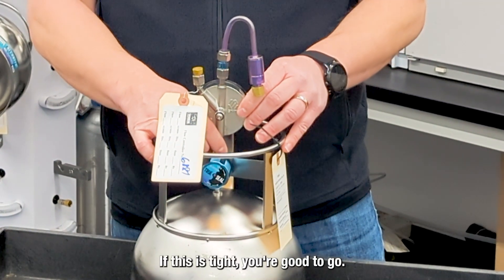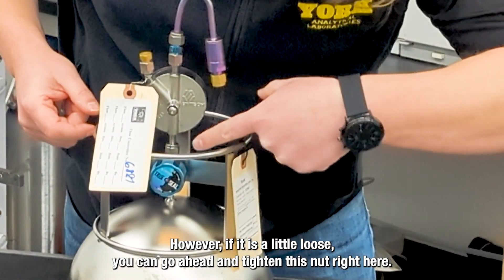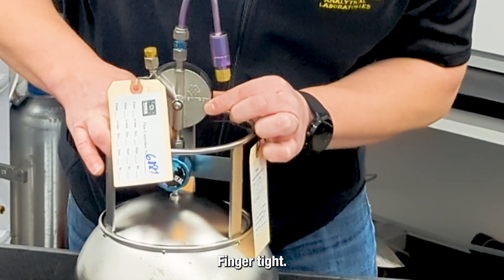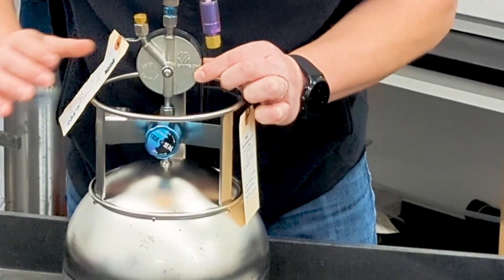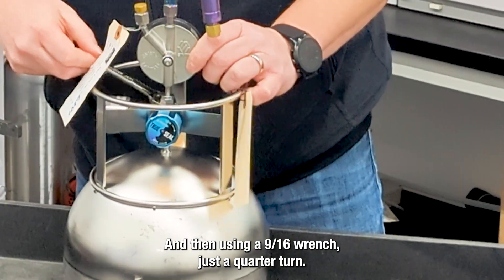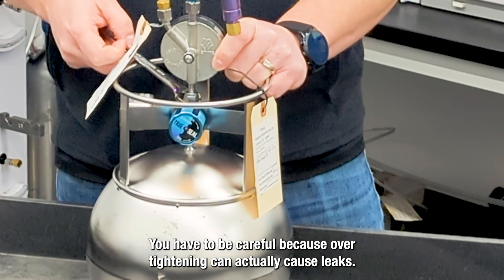If this is tight, you're good to go. However, if it is a little loose, you can go ahead and tighten this nut right here — finger tight. And then, using a nine-sixteenths wrench, just a quarter turn. You have to be careful because over-tightening can actually cause leaks.